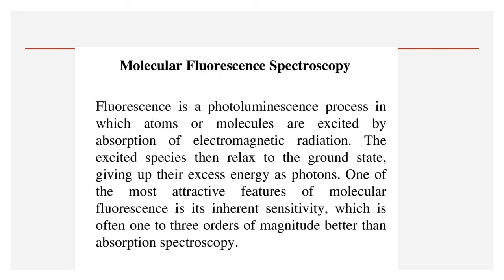Molecular fluorescence spectroscopy. Fluorescence is a photoluminescence process in which atoms or molecules are excited by absorption of electromagnetic radiation. The excited species then relax to the ground state, giving up their excess energy as photons. One of the most attractive features of molecular fluorescence is its inherent sensitivity, which is often one to three orders of magnitude better than absorption spectroscopy.